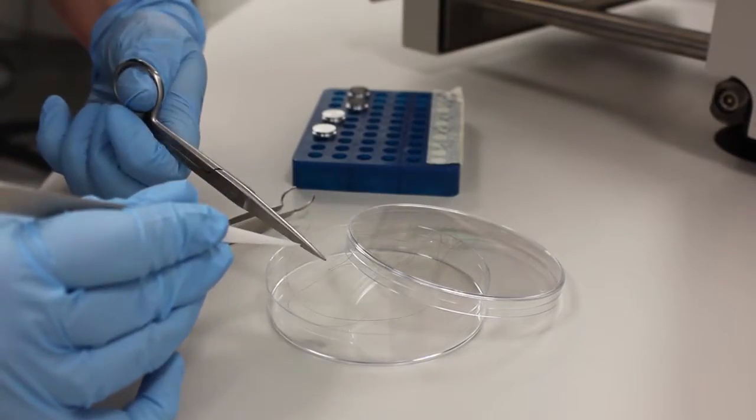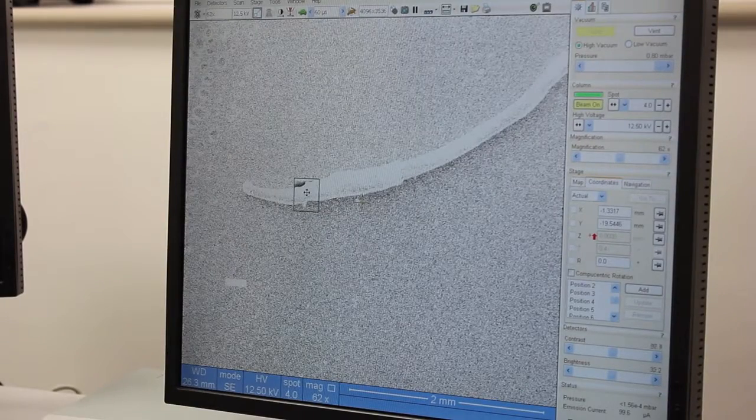At a variety of different objects, the most important thing is it allows us to look at surface features of what we're interested in. Rather than being a 3D image itself, it allows us to look at the surface of different types of objects.